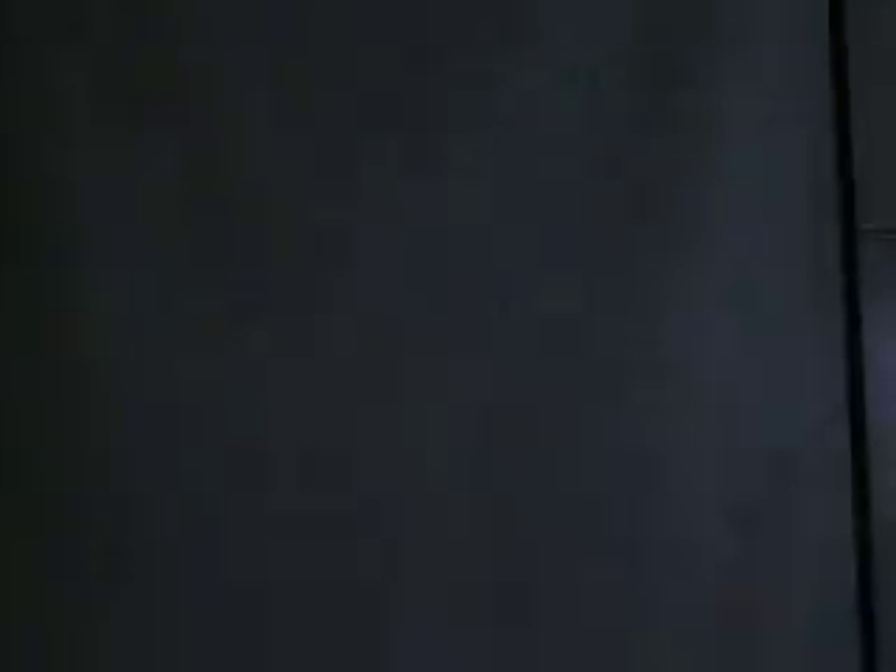Now we're going to look at stele types. Number 9 is the stem of a whisk fern. See how the xylem radiates outward with no pith — that would be an actinostele. Number 10 is a Lycopodium rhizome or stem, and here the xylem is in thin plates that can be branched — so this would be a plectostele.